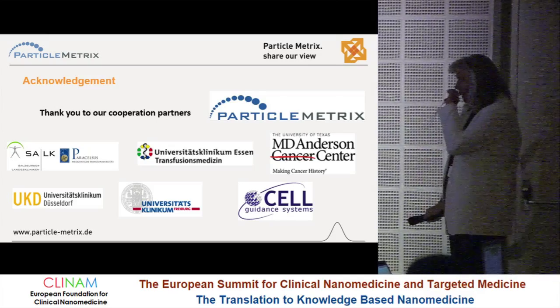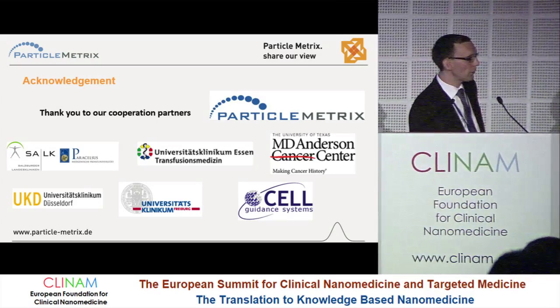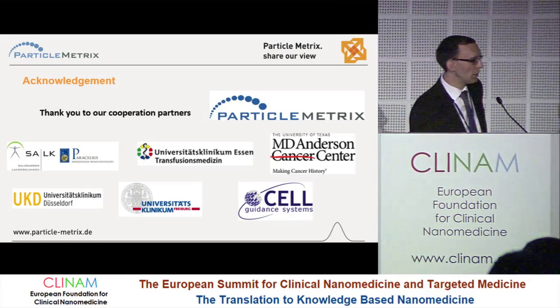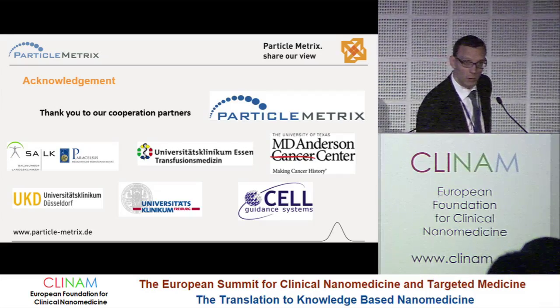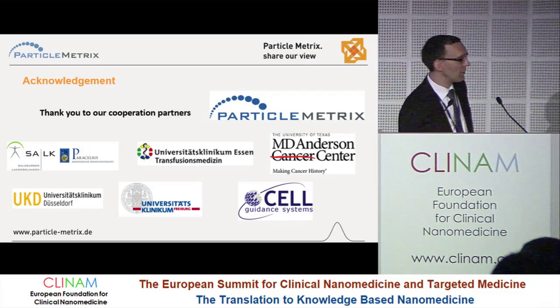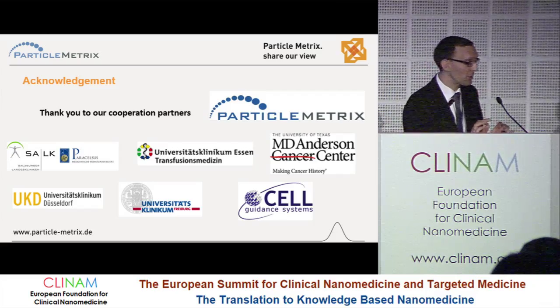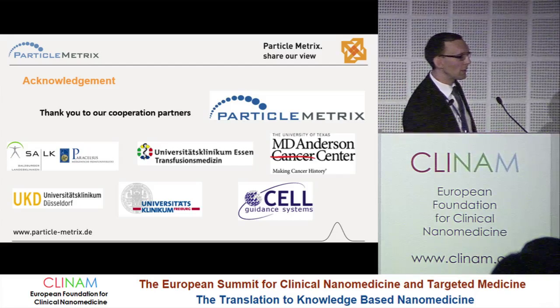Yeah, basically NTA is a technique where you can go down to very low concentration levels, down to 10 to the power of 4 particles per milliliter. This is a very low number, and it is basically about concentration and particle size. But again, I want to point out this is a physical characterization. We cannot tell if this is potentially toxic or not. Based on some physical parameters, we could guess, to be very honest, if it's silicon dioxide or gold. We could see that by the refractive index.